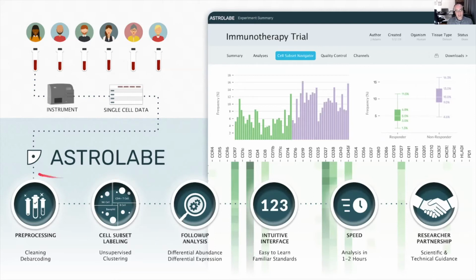And again, the emphasis is on a turnkey solution. You don't need to know any bioinformatics. You don't need to know any programming. You don't need to set any parameters. Everything is done automatically by the platform. And then you can step in and navigate through our intuitive online interface where everything is point and click, very easy to survey the different results, different hypotheses, and decide what is interesting for your experiment.